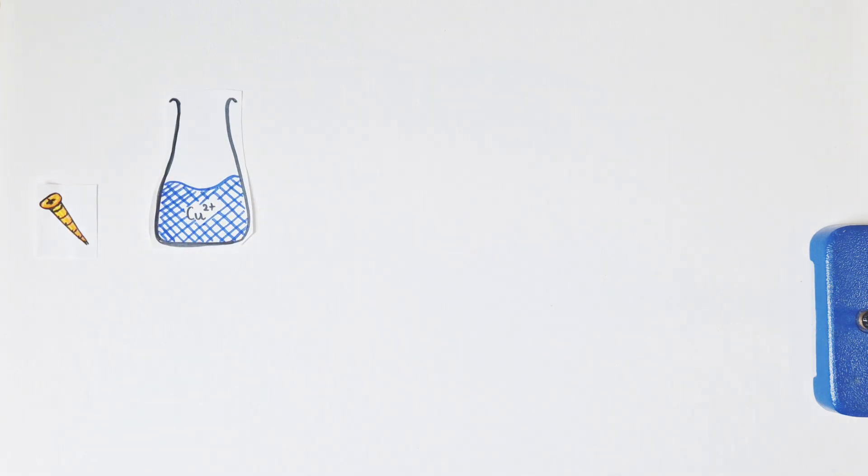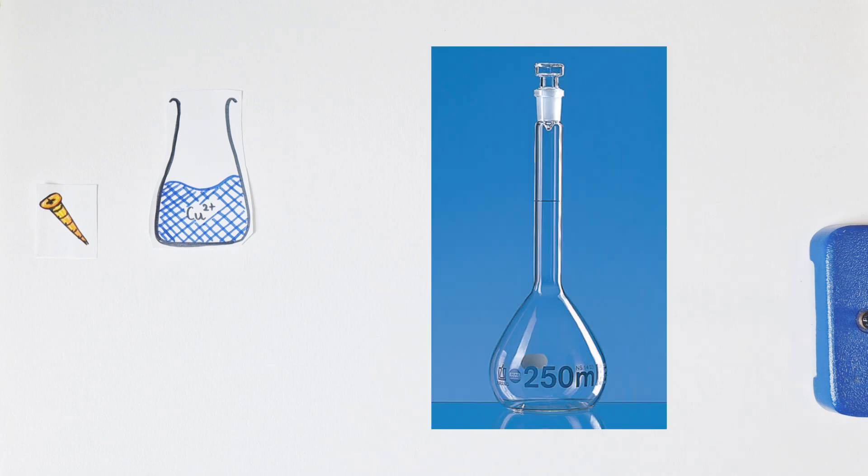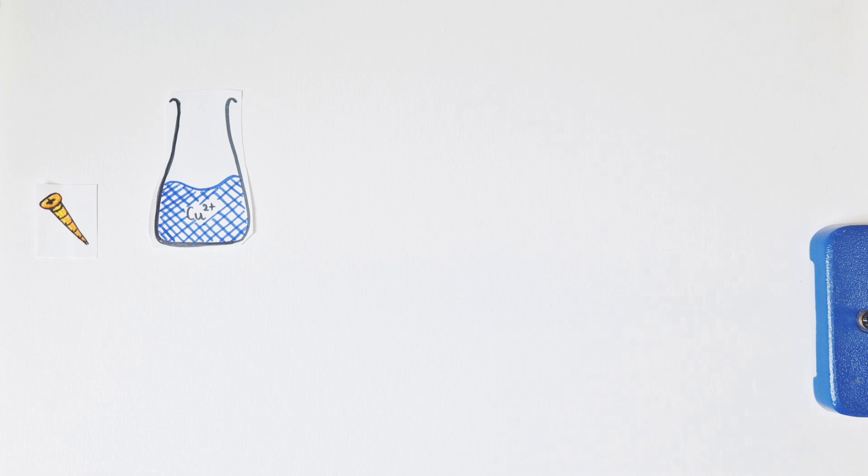We then make up that solution to 250 centimeters cubed with distilled water using a volumetric flask, and then we can take 25 centimeter cubed samples or aliquots of that copper 2+ ion solution to carry out our titration at a later stage.